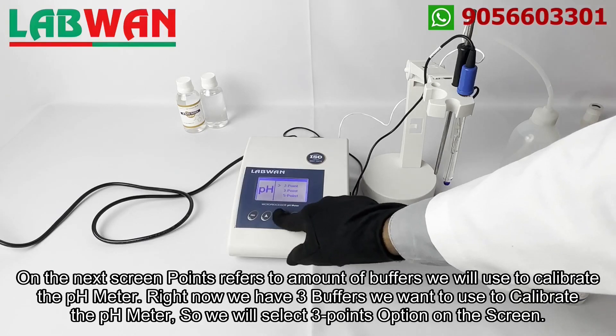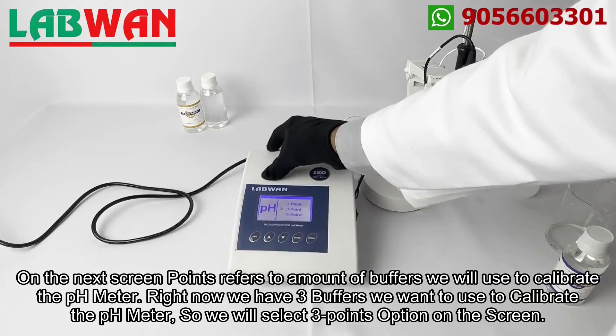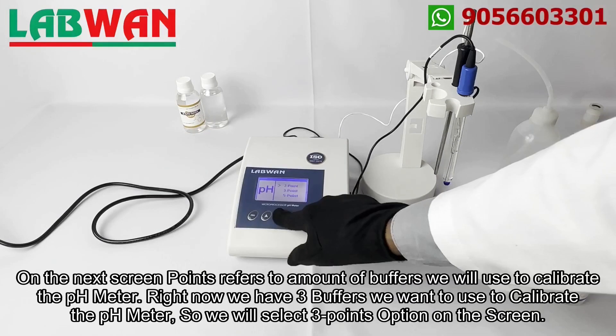On the next screen, points refers to the amount of buffers we will use to calibrate the pH meter. Right now we have three buffers we want to use to calibrate the pH meter, so we will select the three points option on the screen.